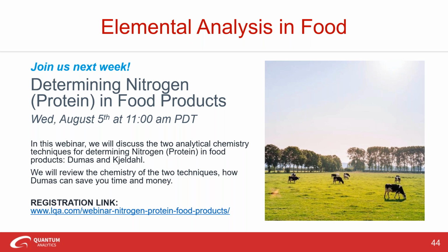Okay, well, that's a good question. Benchtop XRF analyzers are more of a bulk analysis, and they can quickly measure elemental, nutrient, and contamination content in food products, at any stage of your process, from production, incoming raw materials, all the way through to your end products. Micro XRF is more of a technique with a spatial resolution significantly smaller than a benchtop XRF, and this enables micron size sample analysis.